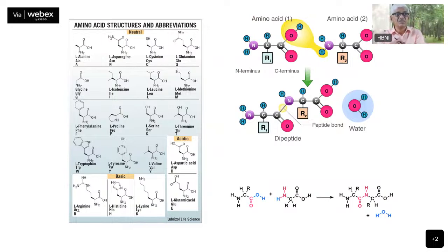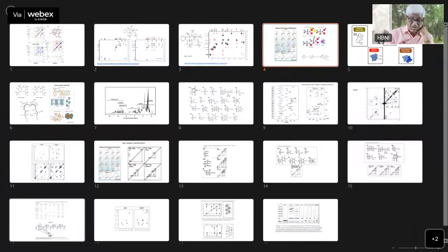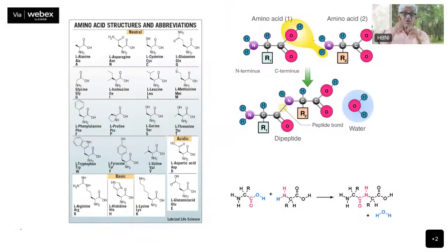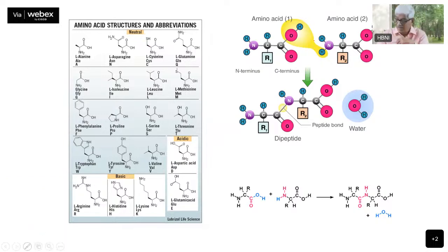So when you have mixed red color, now you can use a different color pen from here. Sometimes your dot falls and it gets confusing whether it is coming across. You can use a different color pen. Yeah, I think that's better, when that color is already there. I will use this. When they read it, they will see it as a signal.